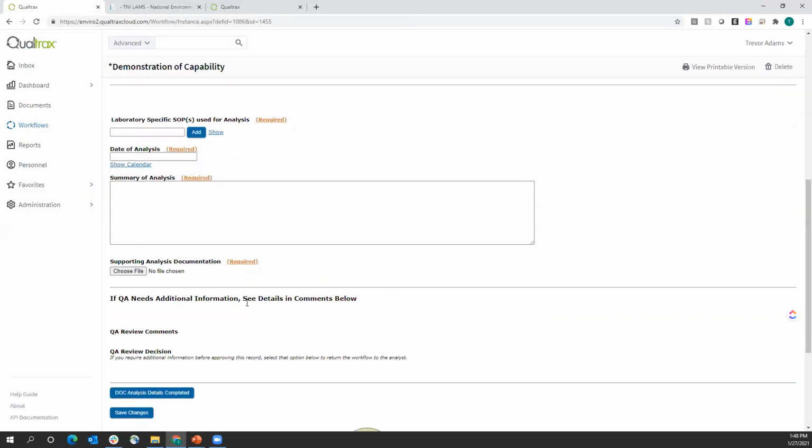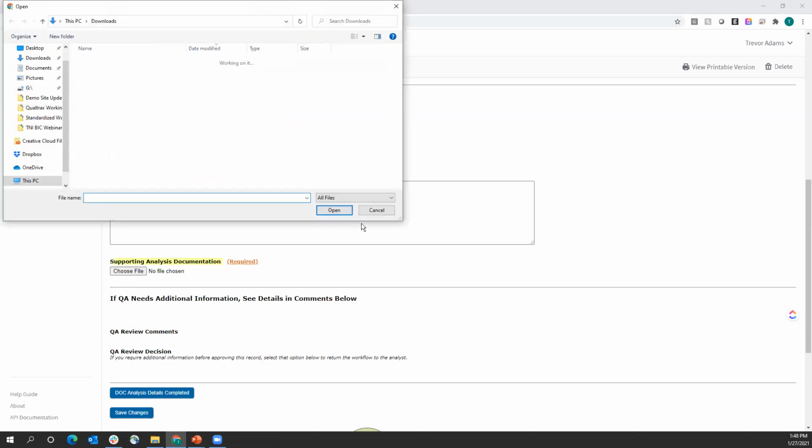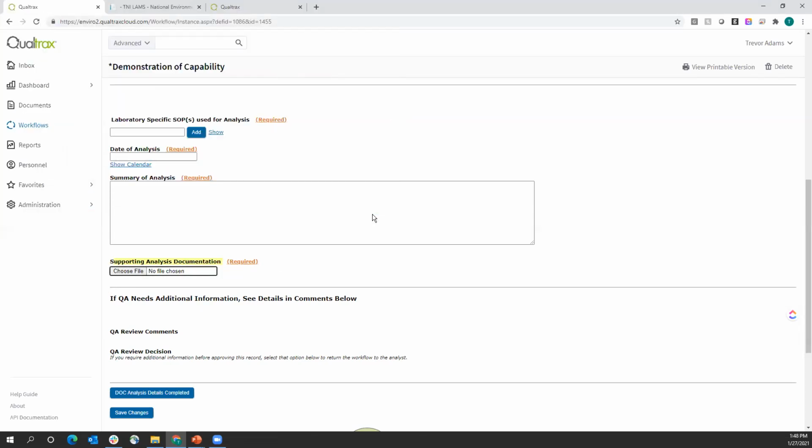And like we've said before, you can also add additional fields here. So if you want, maybe you want the data files and the report to be separated in different fields. So you've got one specifically for the report and one for the data files. You could do that just by adding in an additional field here. It's pretty easy.